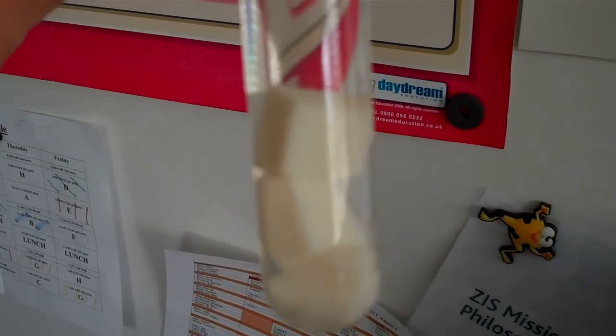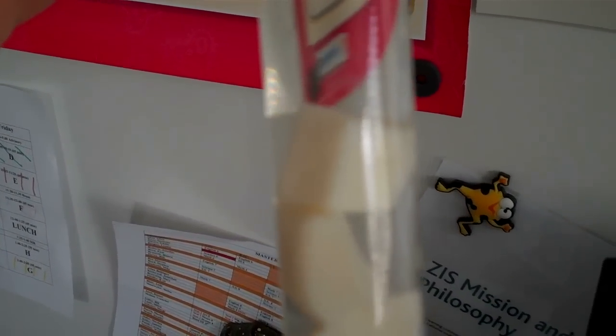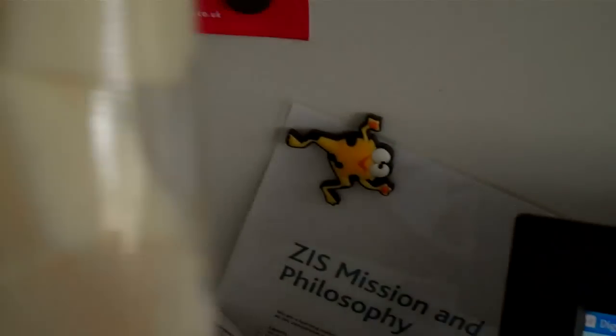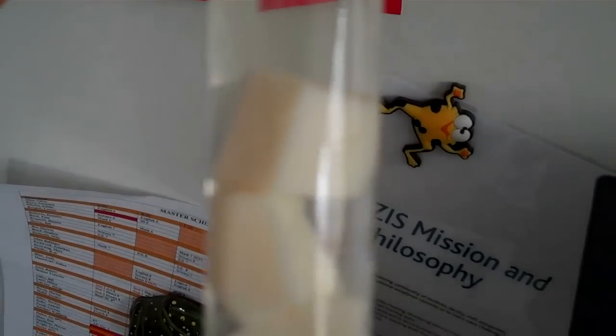So we have some egg white, and you can see here in each test tube there's going to be three pieces of egg white. In test tube A, we're going to put the enzyme pepsin with our egg white.